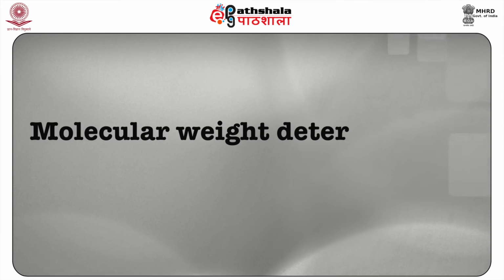Fourth is molecular weight determination. As we have mentioned earlier, separation of various components in the sample is based on their differences in molecular size. The larger the molecular weight of the compound, the lesser the elution volume. In fact, this method has been exploited for determination of the molecular weight of solutes, particularly proteins, from their elution characteristics, that is VE or KD value.